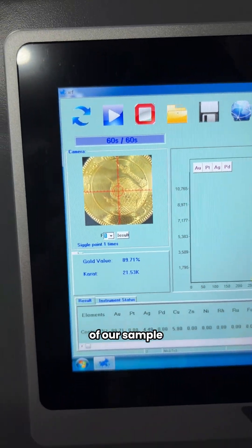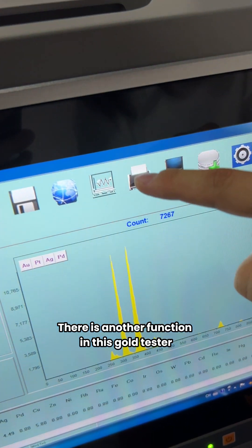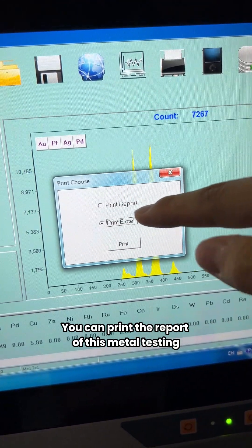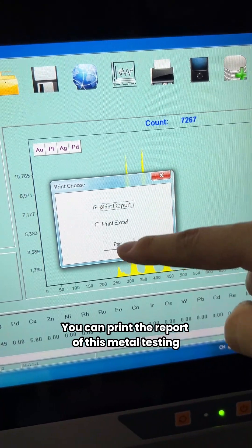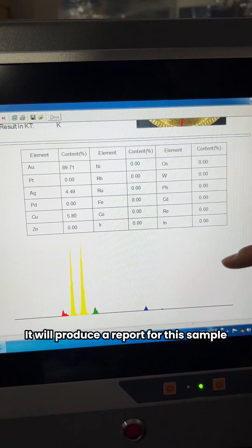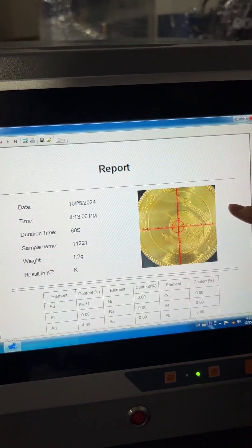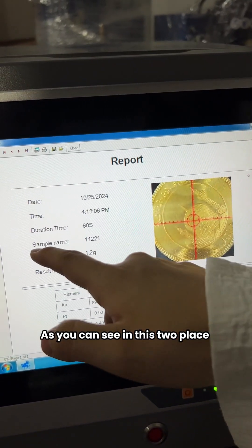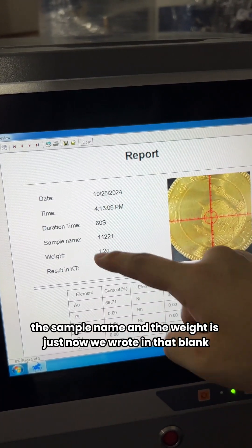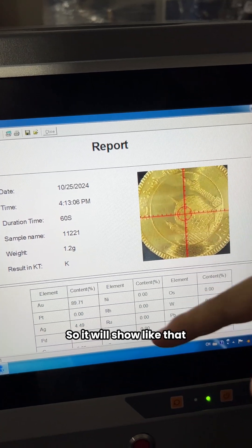The result is 21k gold. There is another function in this gold tester — the printing. You can print the report of this metal testing. It will produce a report for this sample, and as you can see, the sample name and the weight we wrote are shown on the report.